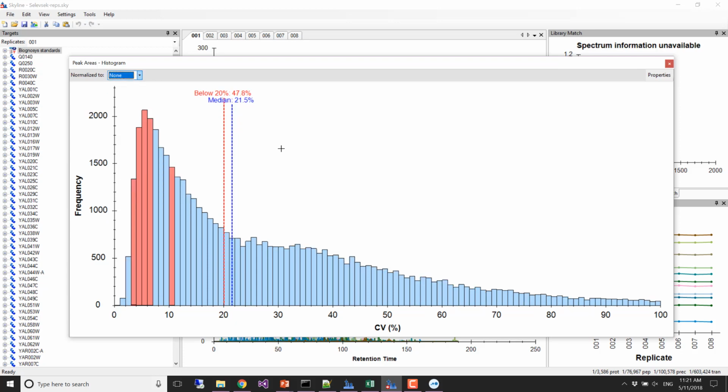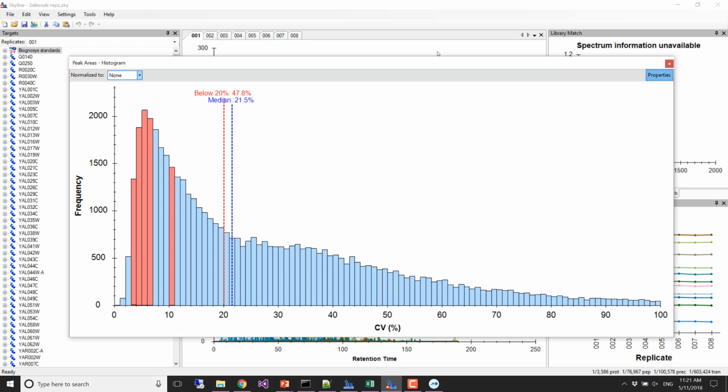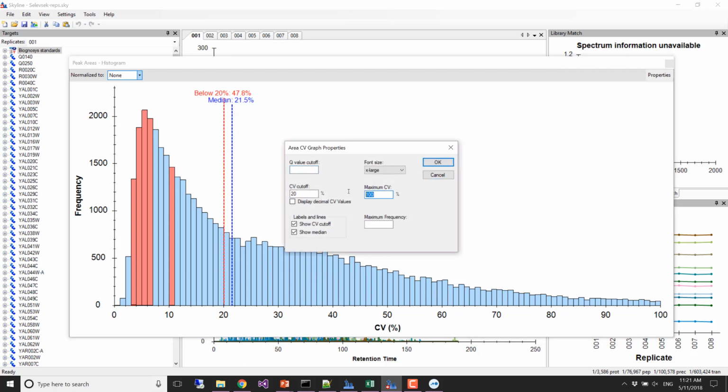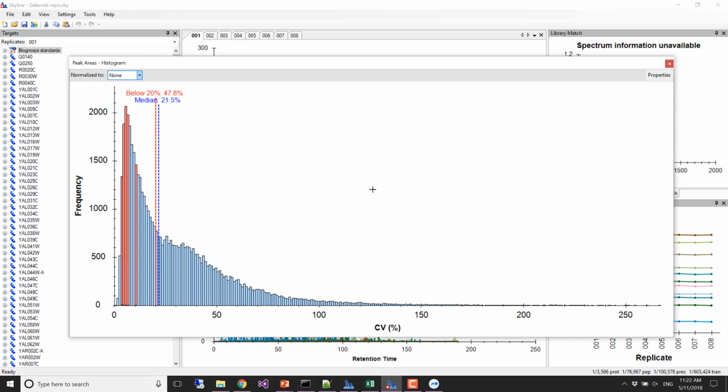If I go to none and I turn off my maximum of 100, do other people have the maximum of 100? We did that yesterday. So is everybody looking at something like me? It looks like this.